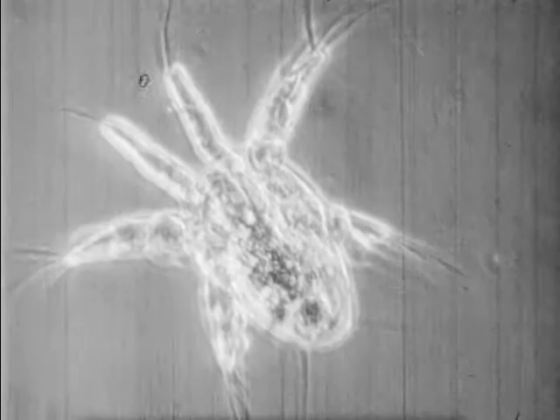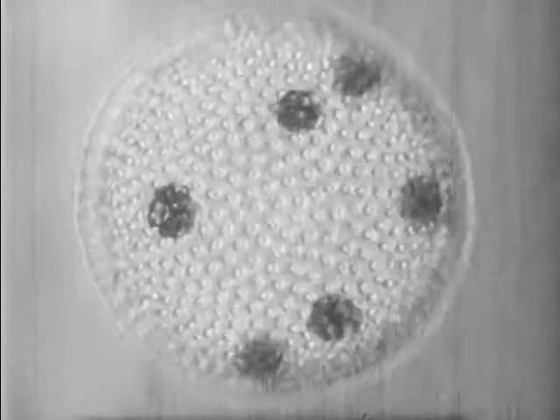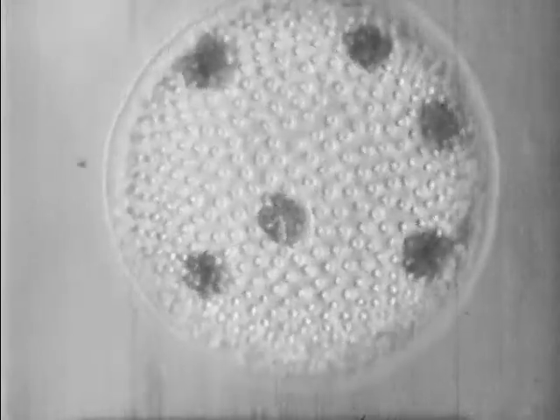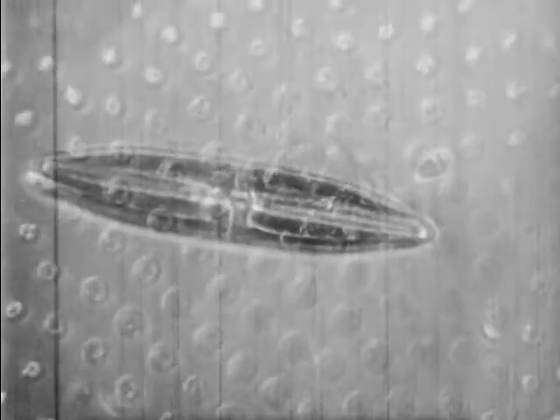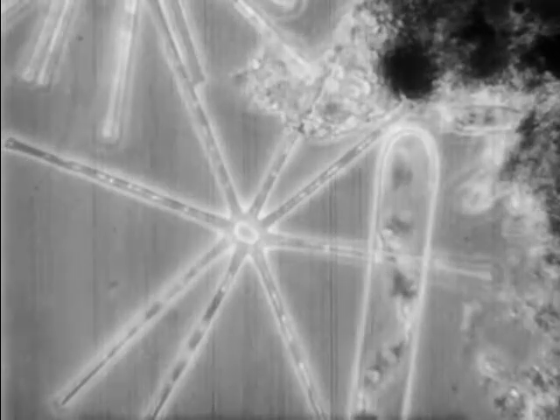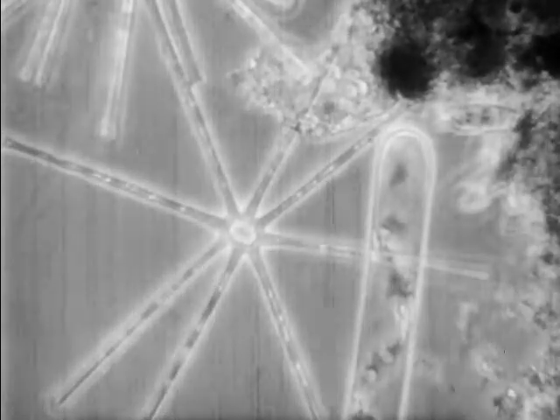Many objects in this water contain thousands of cells. And yet we could only see white specks until we looked at the water through a microscope. The cells of this tumbling ball contain a green material that is like the green material in leaves and grass. This is a single plant. This star-shaped body is made up of 8 cells, and they also contain the green material.